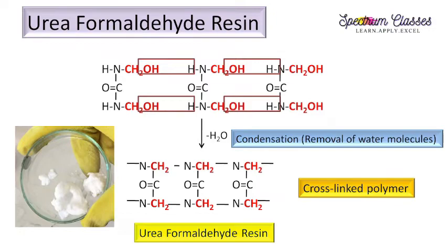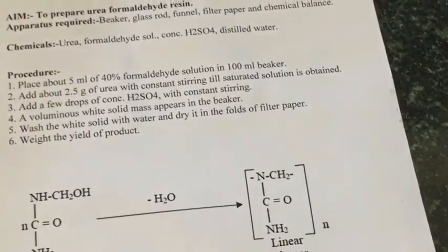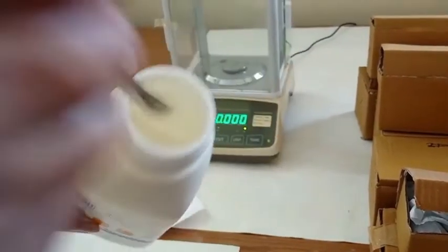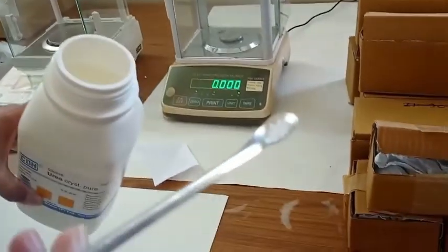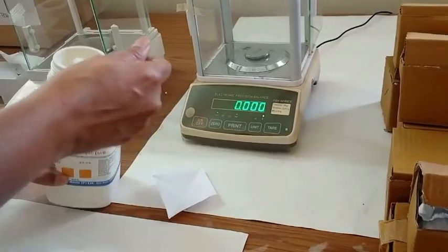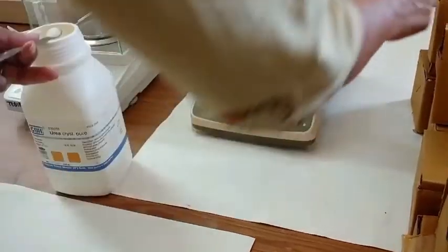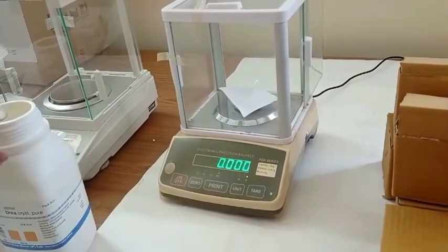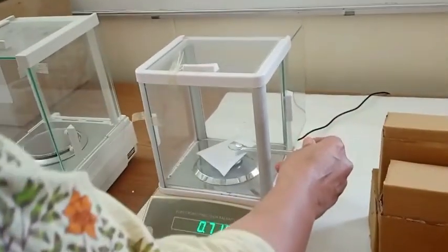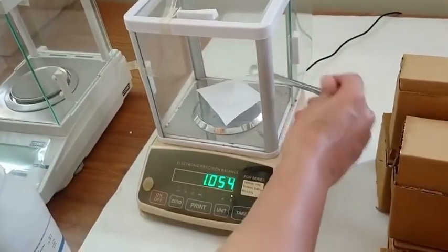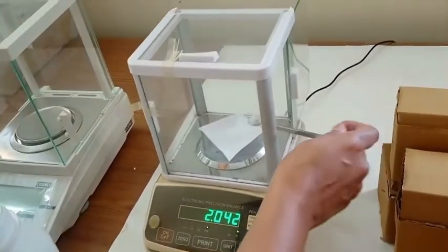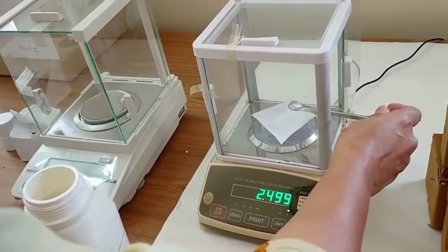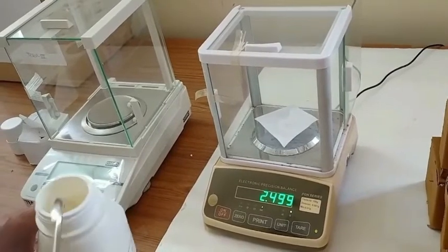Now I will show you the experiment. The aim of the experiment is to prepare urea formaldehyde resin. This is the urea, its CAS number, its molecular formula — see how it looks. Now we are going to weigh 2.5 grams for this experiment. It is about 2.5 grams.